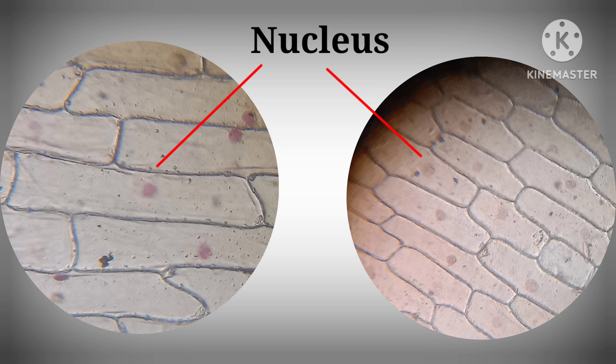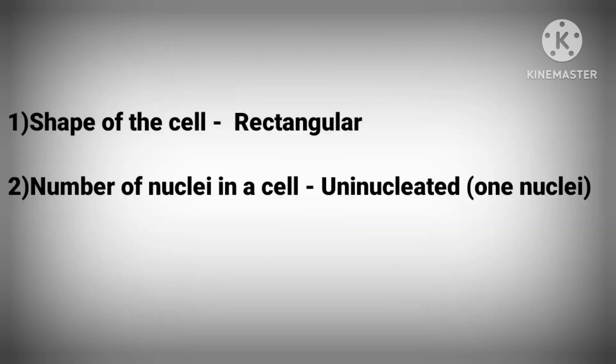You can see here the red-colored nucleus present towards the periphery. The shape of the cell is rectangular, and the number of nuclei in a cell is one — that is, uninucleated.